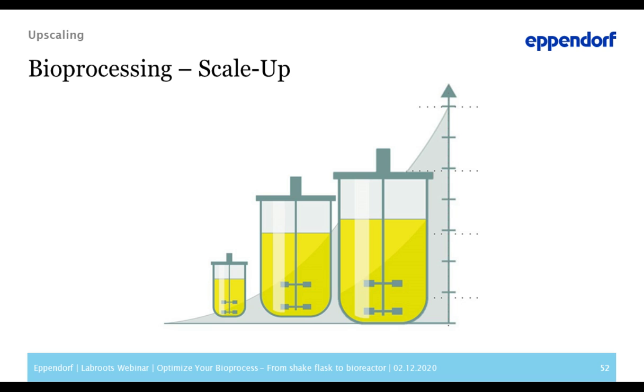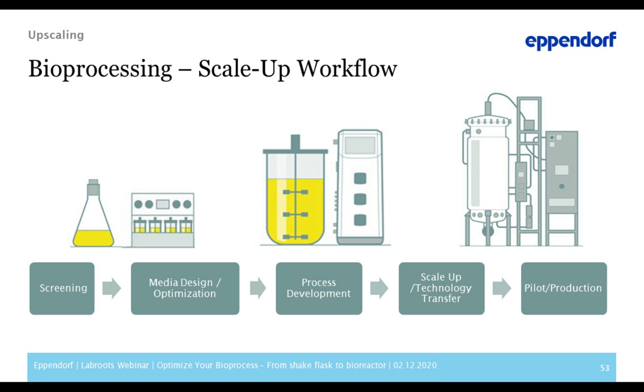Just think about vaccines or biopharmaceuticals. So scaling a process means a stepwise transfer of an established process in small volume to a large volume, while keeping the same productivity and quality. The stepwise transition is needed as starting in production scale is usually not cost effective, of course.